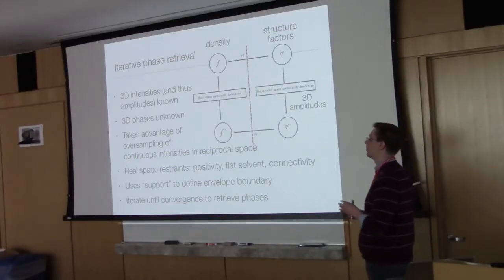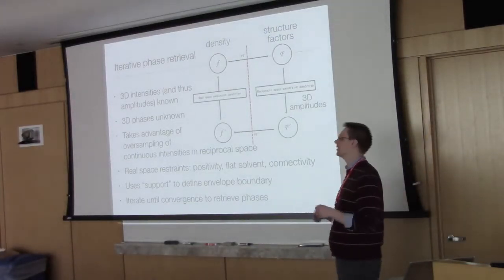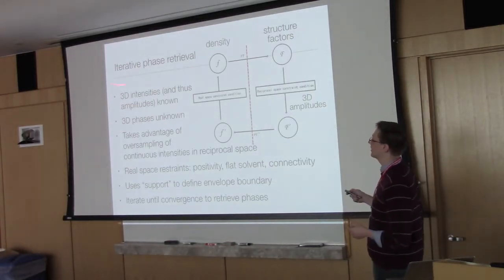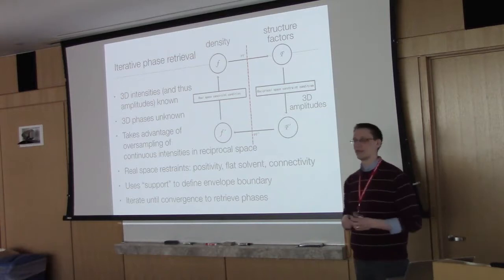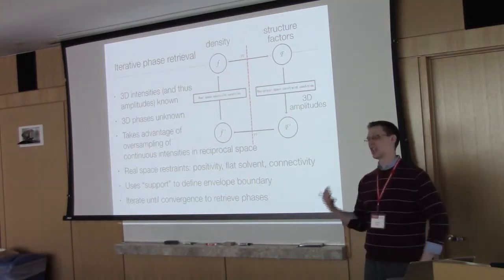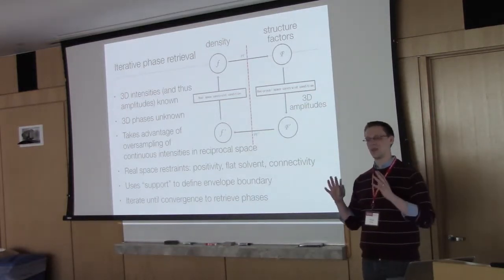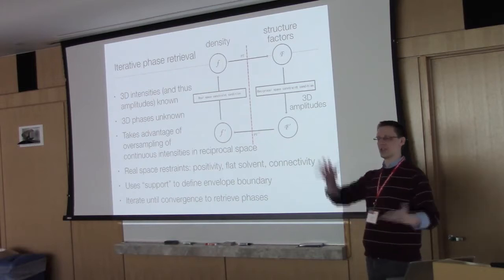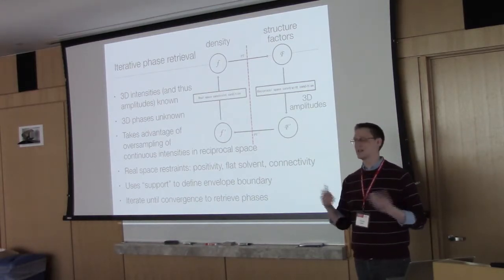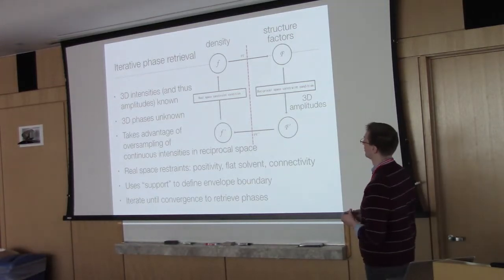All right, so if we just keep ourselves in single molecule imaging mode for the ideal case, we can get an idea of how they do this. And they do this using a process called iterative phase retrieval. And I say they do this, but single molecule imaging at this stage is not really a thing, sort of. The single molecule X-ray diffraction, at least. They've done some initial proof of concepts with giant Mimi virus type particles with XFELs, and it is becoming more practical, but it's still a ways out.